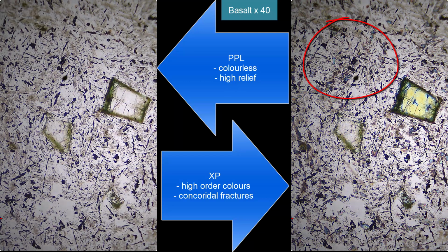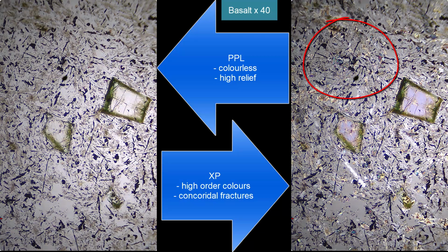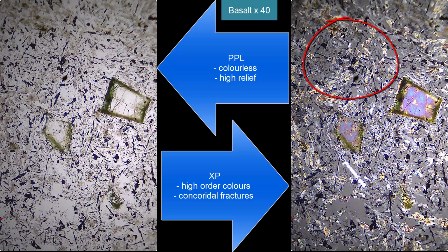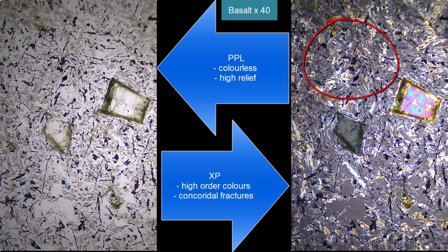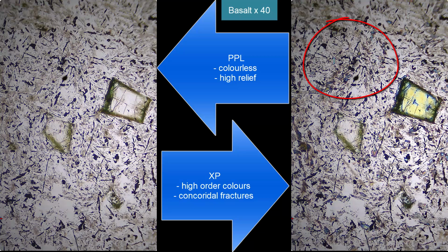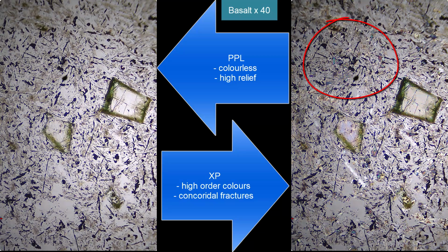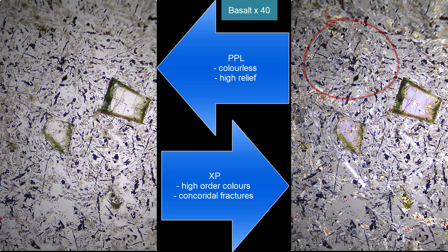And so that was a reason enough just to show you what it is, why we use the intrusive large crystals rather than the extrusive small crystals when we're looking at the minerals. The extrusive has small grains like this basalt and all the other samples in the video besides the metamorphic and sedimentary rocks. I've got a few of those. Most of them are igneous, and they're all intrusive with large crystals, so you can make out the features.